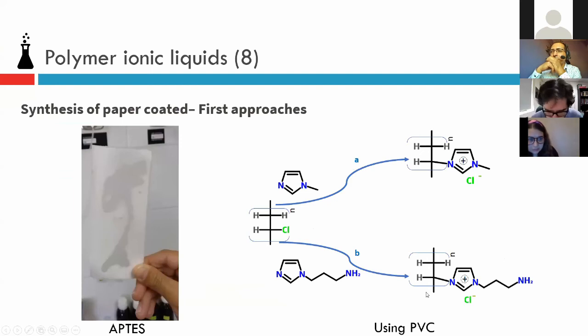I mean, you show here that when you use, let's say, the aminoimidazole, you get a reaction on the imidazole, but actually the primary amino group should be more nucleophilic, don't you think? I mean, have you actually any proof that that's exactly the way it's reacting? I mean, not that it actually really matters probably for the application, but.